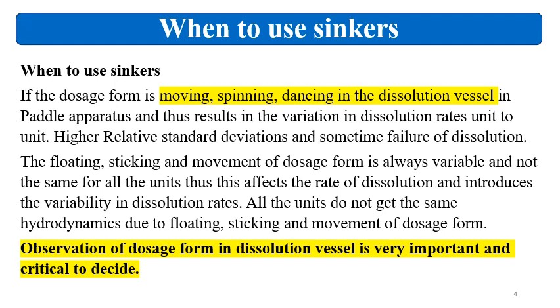The floating, sticking and movement of the formulation is always variable and is not same for all the units, and thus this affects the rate of dissolution and introduces variability in the dissolution rate. All the units do not get the same hydrodynamics due to floating, sticking and movement of the dosage form.